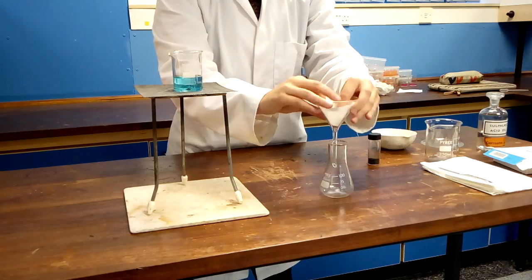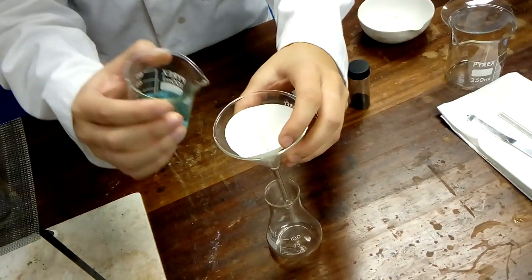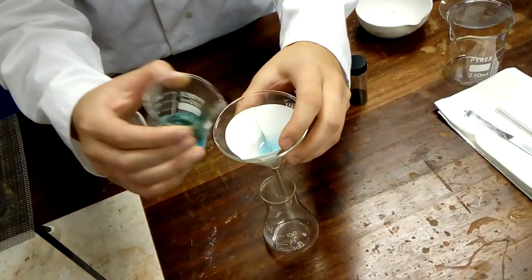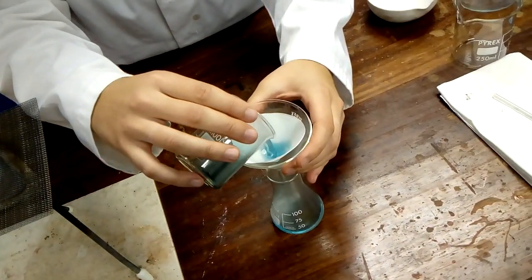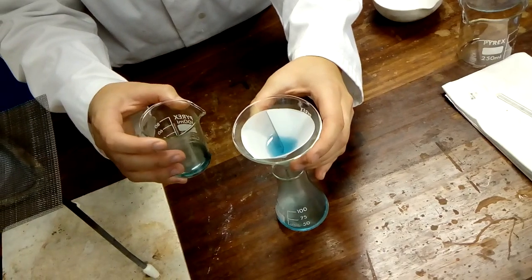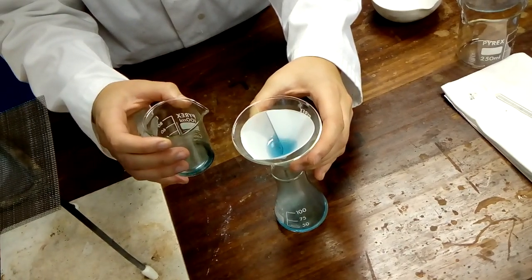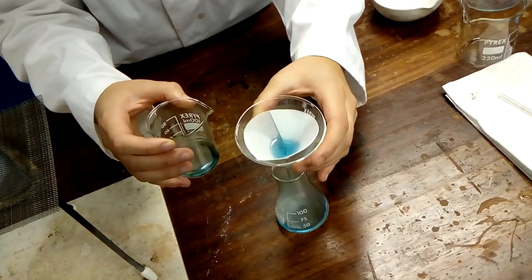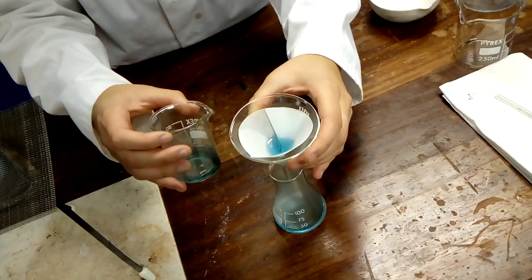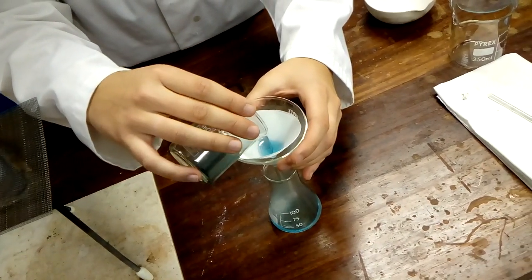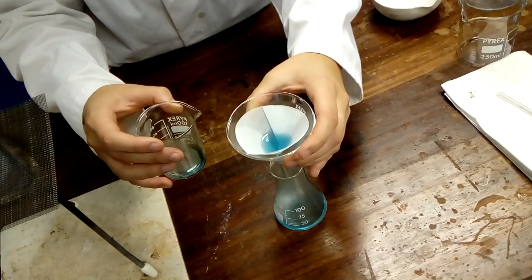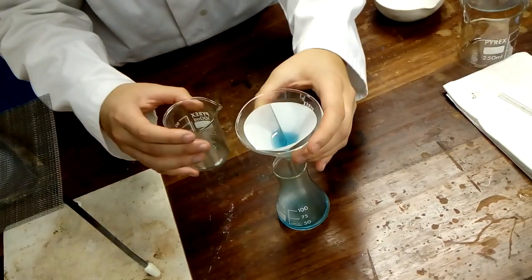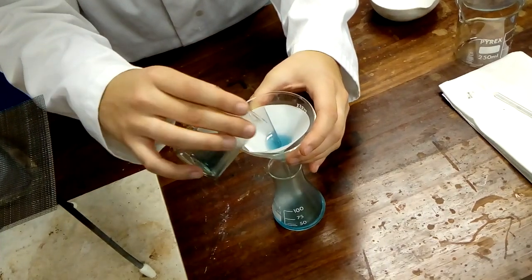When the beaker has cooled enough for you to handle you can start to filter. Lift the funnel above the conical flask and pour in the contents slowly by adding small volumes at a time. Be patient as it can take a while for the solution to filter through. As you get towards the bottom of the beaker give the solution a swirl to make sure you filter out all of the copper oxide powder.